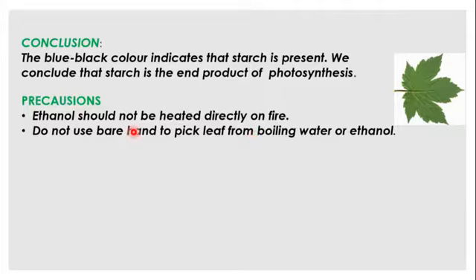So take note, do not heat ethanol directly on fire while in the test tube. Why? Because ethanol is highly flammable, or can easily catch fire.